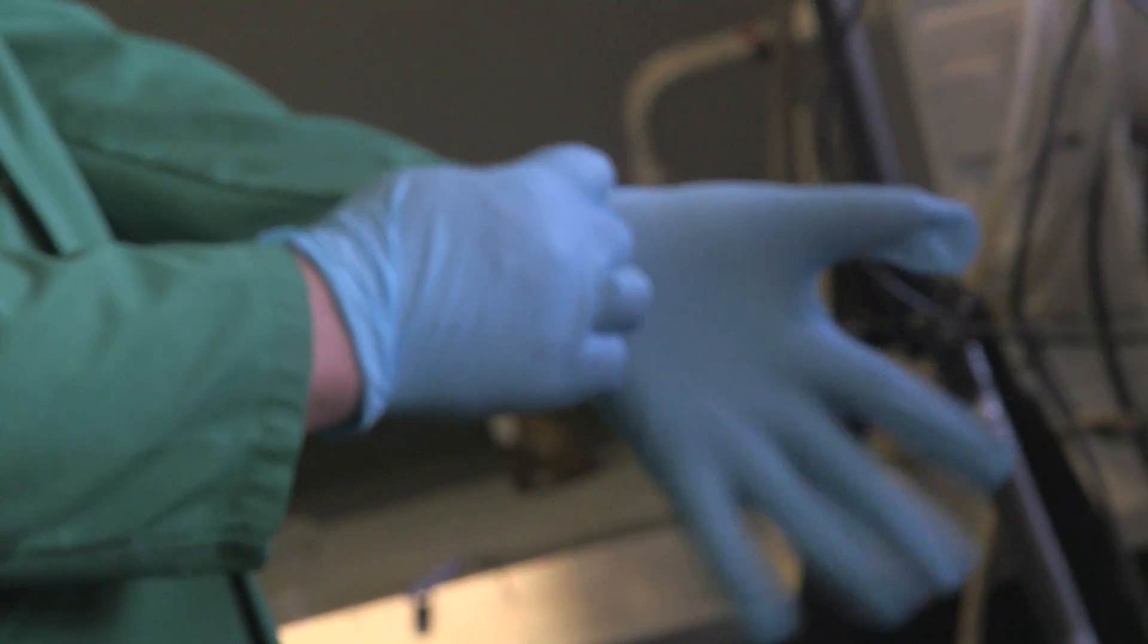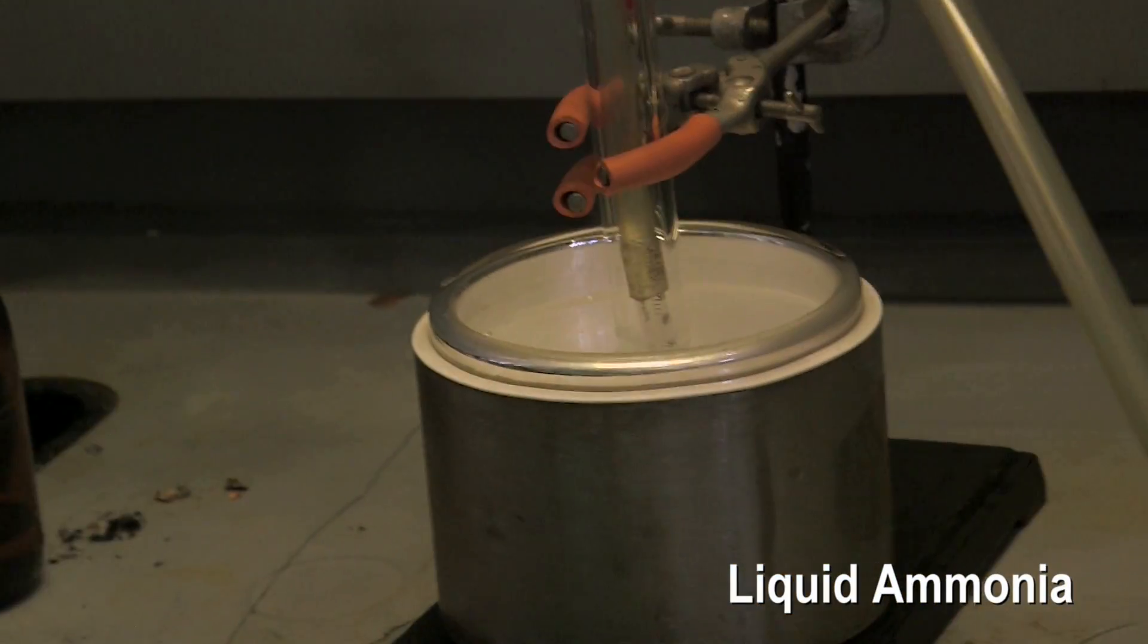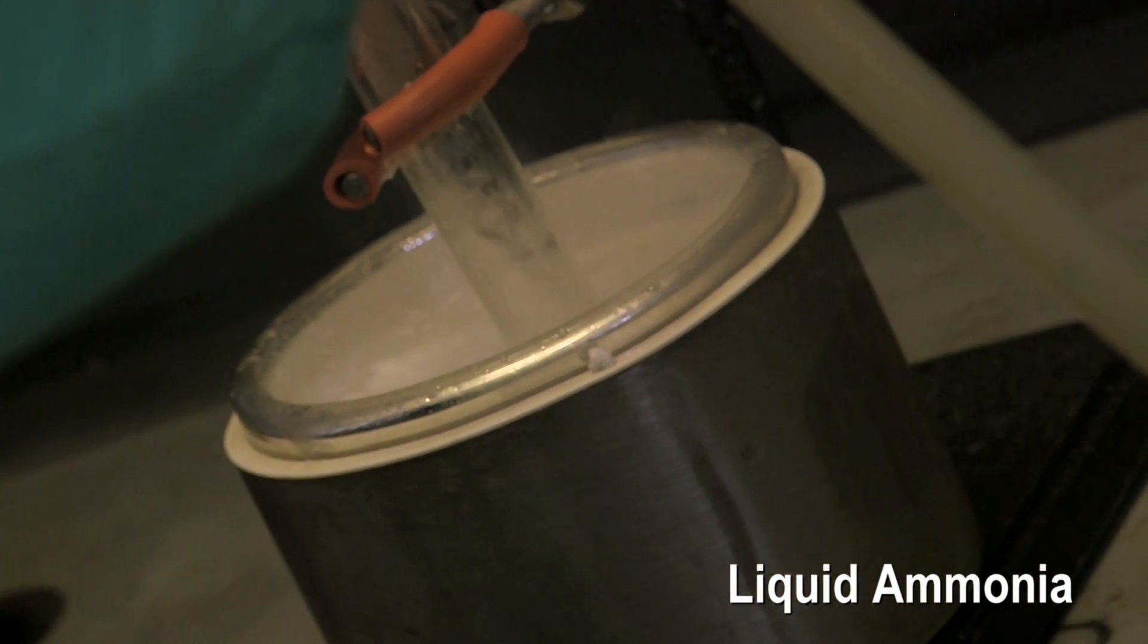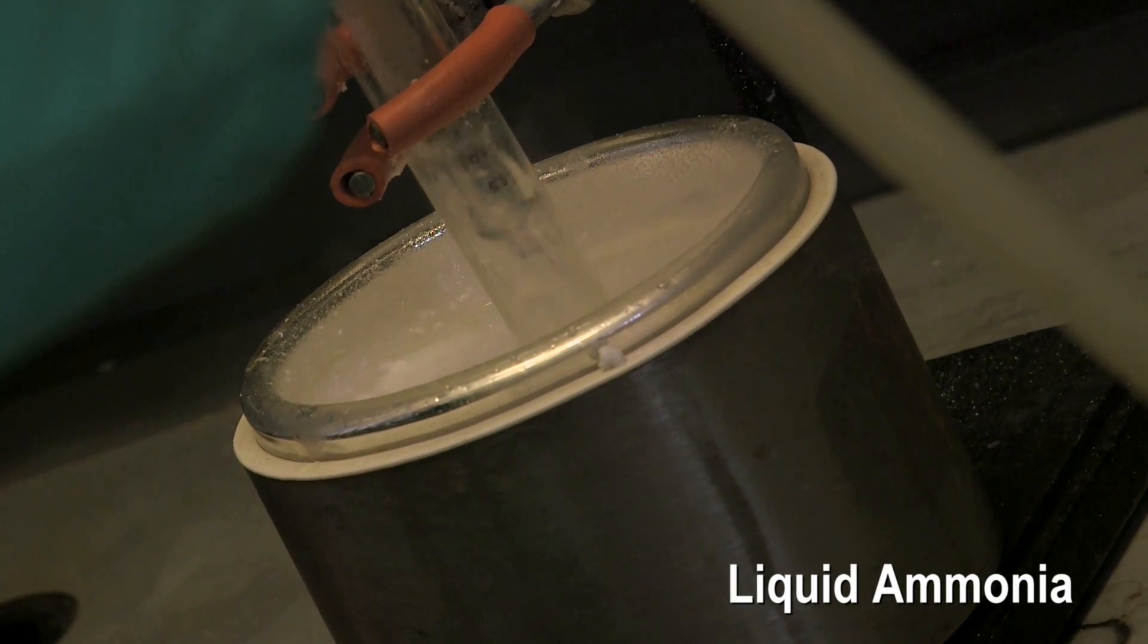We're going to put some sodium into liquid ammonia. What happens is that the sodium reacts, it releases an electron, becomes sodium single plus, and those electrons get solvated by the ammonia.